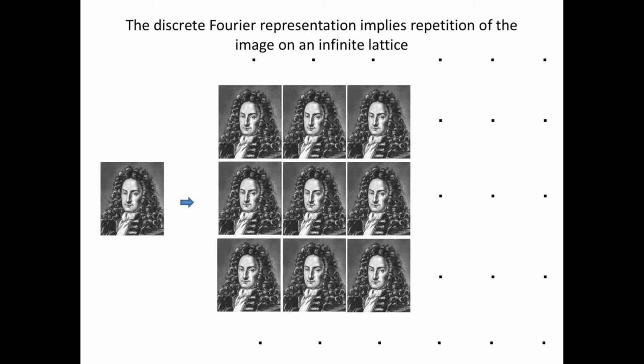And that's important. It's important to understand what is happening when we use the convolution and the correlation theorem.